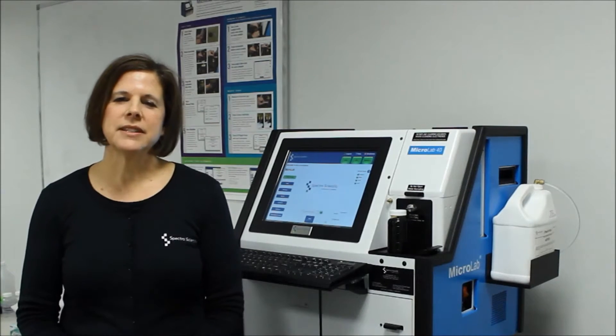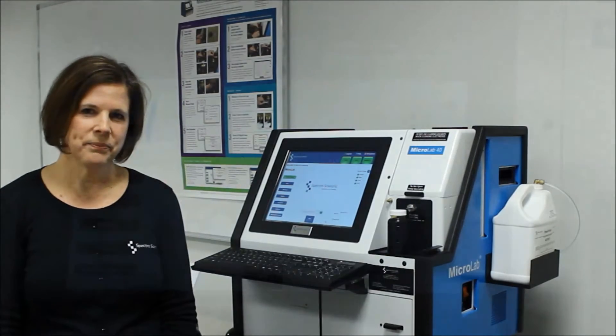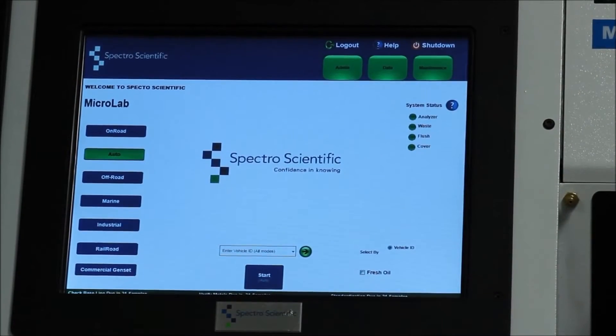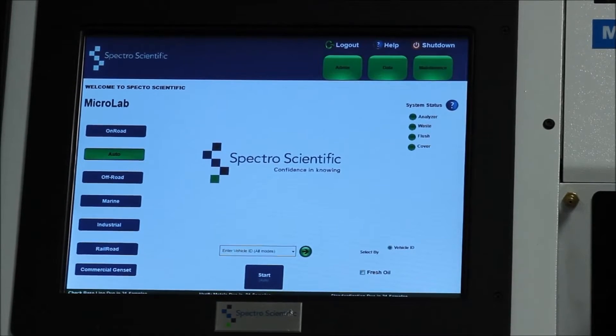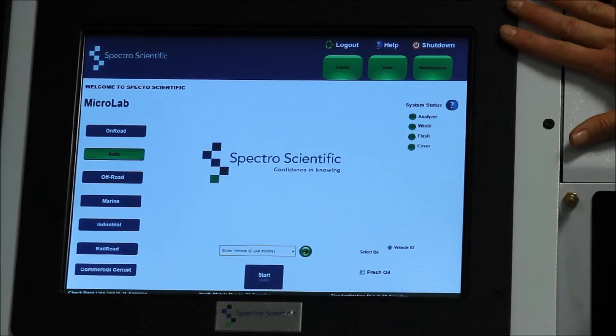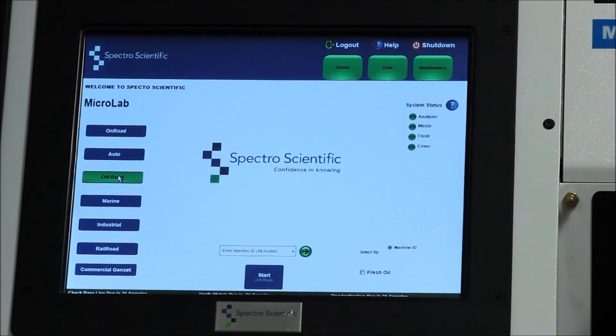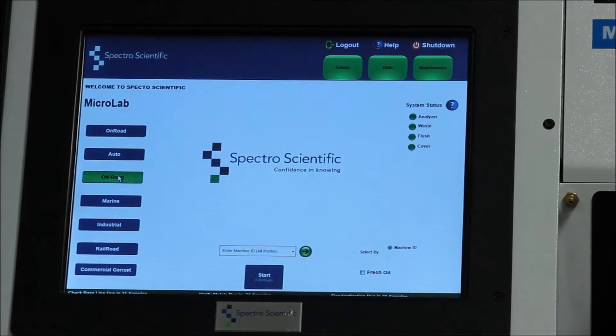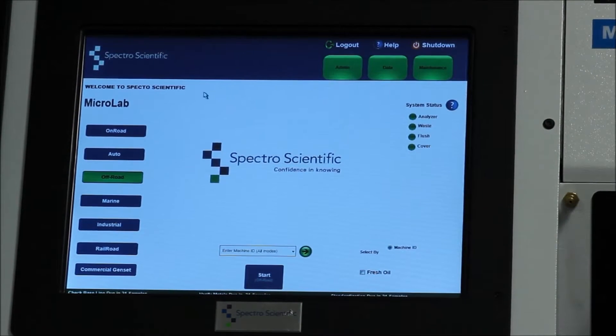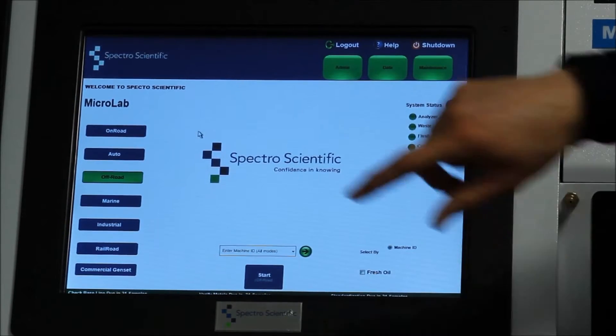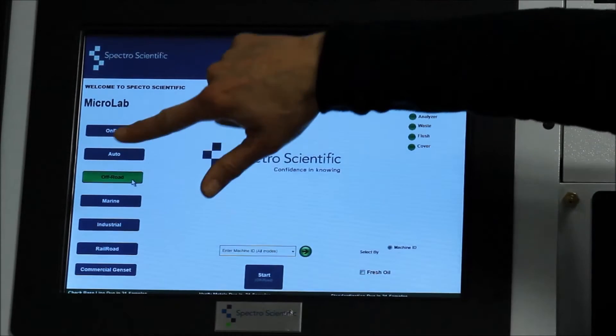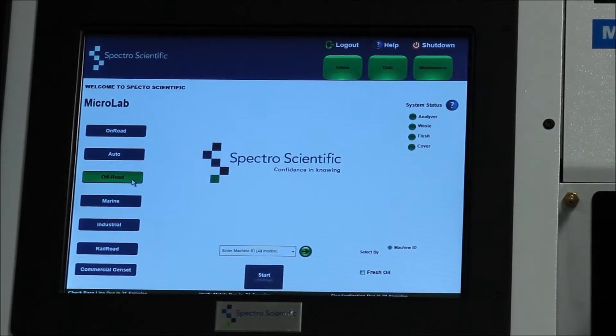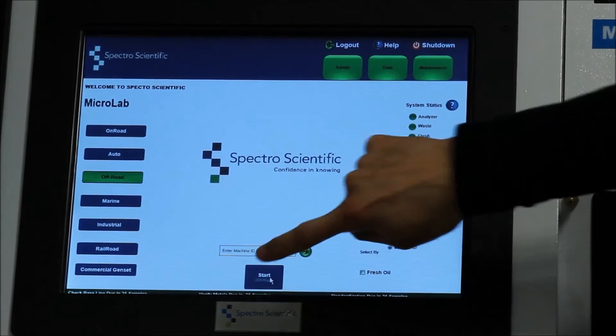So let's take a look at the operation of running a sample. To start a sample, we're going to need to tell the Microlab a little bit about the sample and the equipment that is being tested. The Microlab has a full touchscreen computer and an integrated keyboard. You can also connect a mouse to help you navigate through the screens. To start, we're going to choose the application. In this example, we're going to choose off-road as our application. And we hit start.